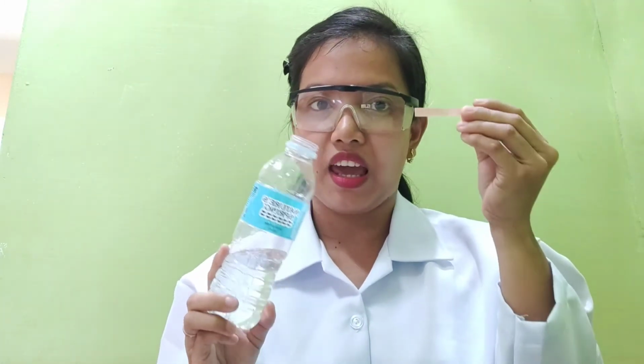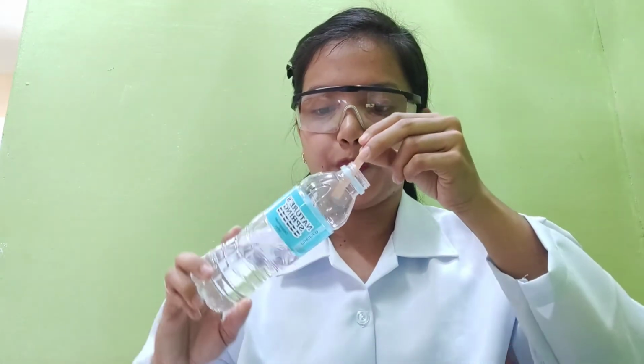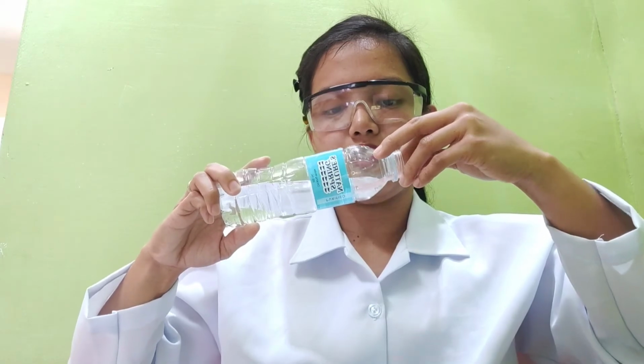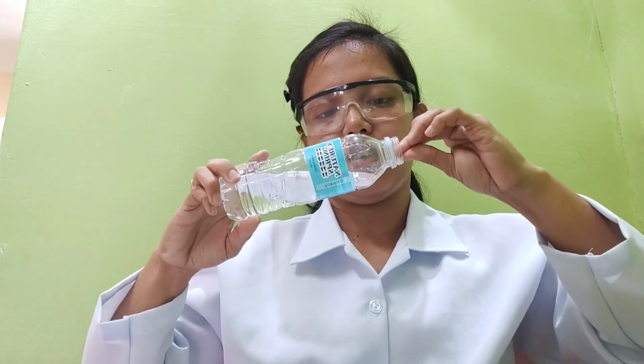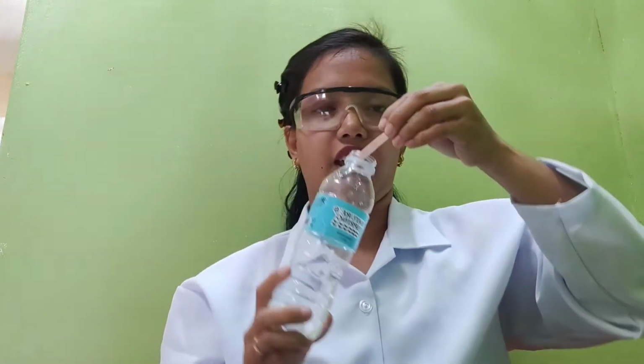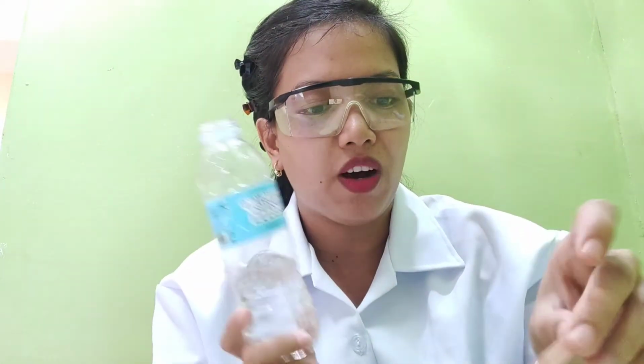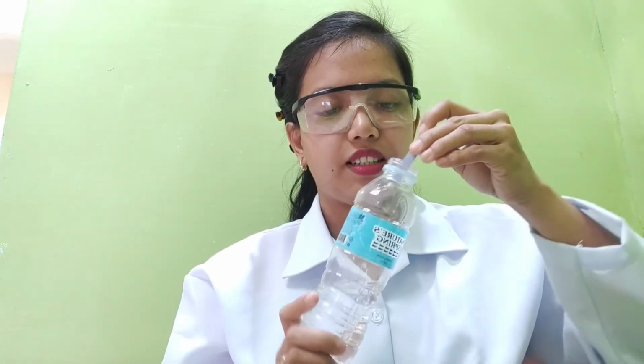Let us use a red litmus paper. You can see the red litmus paper is still the same, it's red. Nothing changed. So this is water. Next, how about the blue litmus paper? We will check.